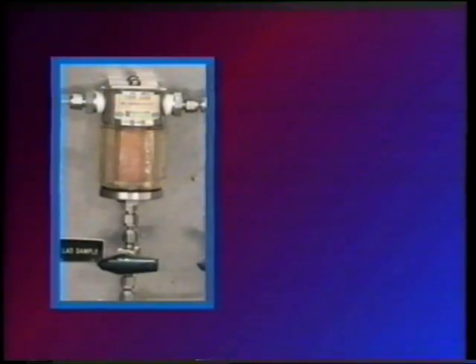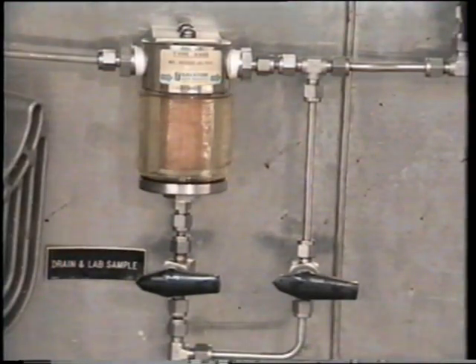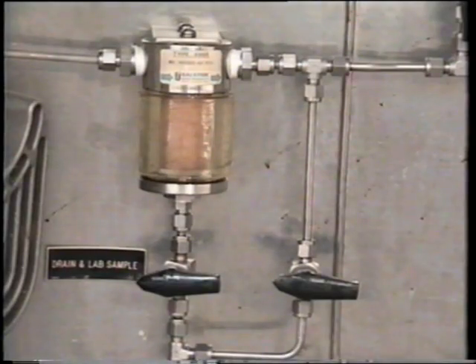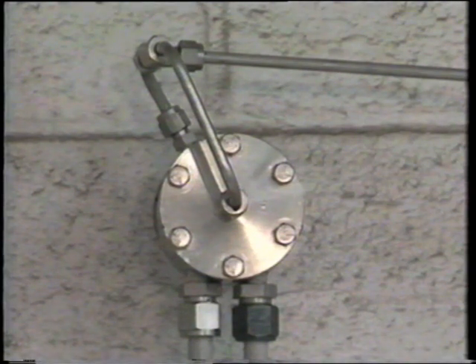There are two basic filter types: filters that are designed to trap occasional particles and filters that are designed to continuously filter all particles out of the process flow. Filters that trap only occasional particles should not be used in a system that requires heavy filtration unless the necessary maintenance time is available. Filters designed for continuous use may be self-cleaning.